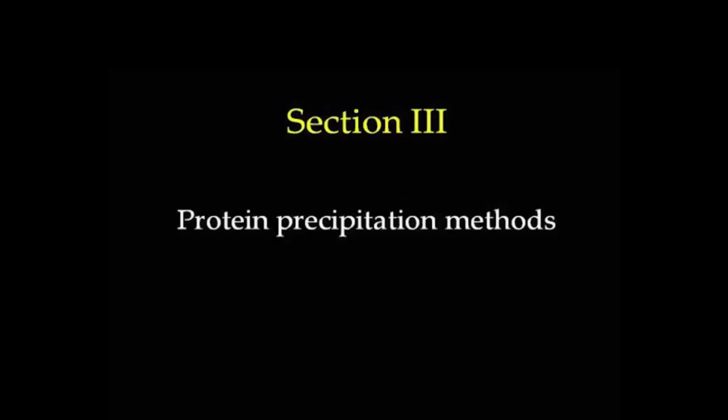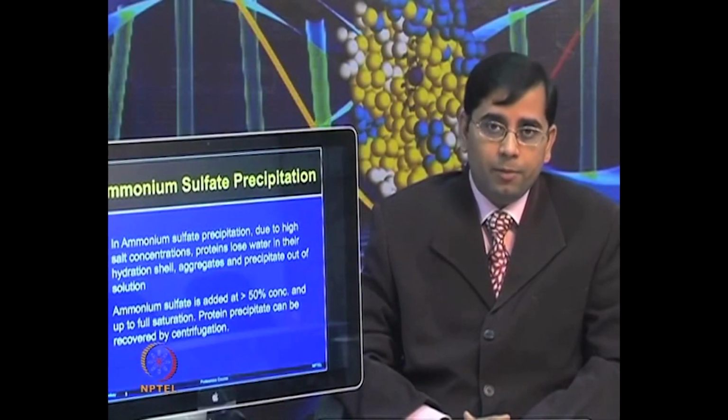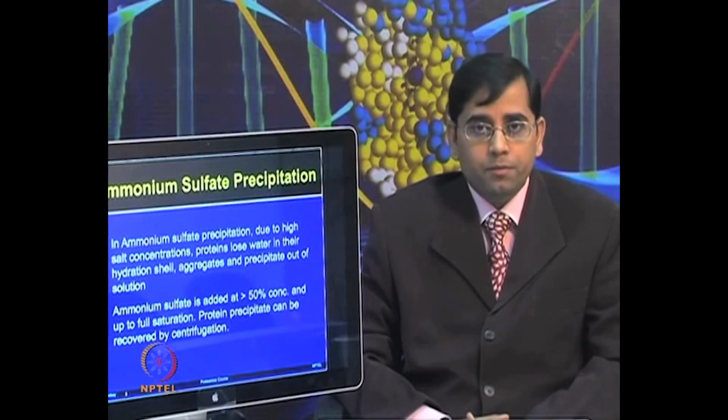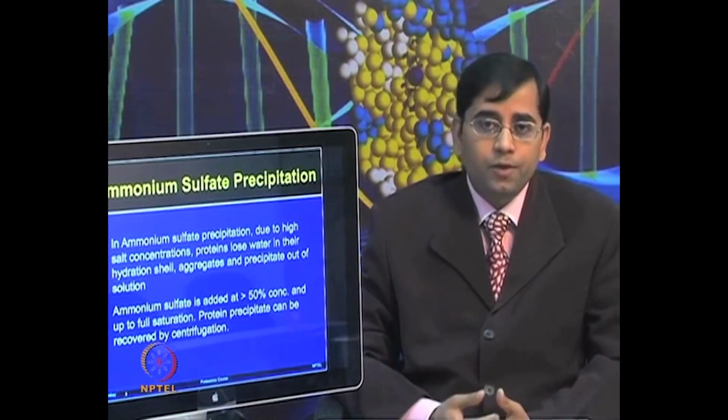So, let us first talk about the precipitation procedures. There are different types of precipitation methods available. I will go through them one by one and then we can give you some recommendation about which ones can be more commonly used.